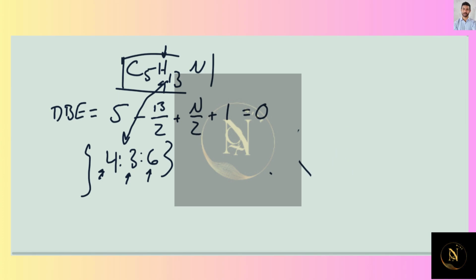Okay, and then finally, if we look at these spectra, I can't zoom in on them, but to me it looks like this is a multiplet of some kind. We don't know if they correspond to 4, 3, and 6 in that way. Oh yeah, left to right. So this is a multiplet, this is some kind of singlet, and this is another multiplet.